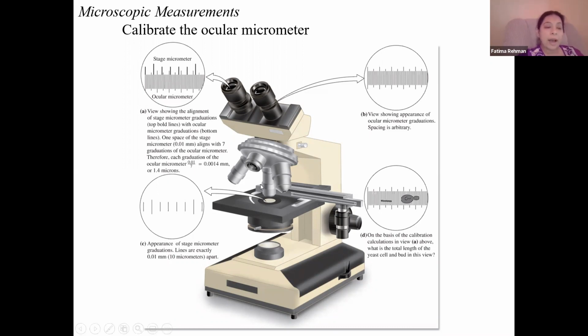We got that. Now, obviously, we use the microscope to magnify our specimens so we can observe them and make qualitative observations about their shape, the way they are behaving, and their physical characteristics that are changing in response to drugs, environmental stimuli, whatever it is that we are looking at. Now, there are quantitative measurements we can take from the microscope as well. However, they involve calibrating our microscope.